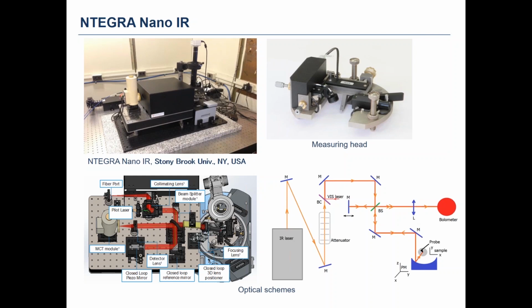And the second point is that if we would work in the scattering s-SNOM mode on the first harmonic of the cantilever oscillation, we actually could use this microscope interferometer as the optical beam detection setup. But the principal idea here is that we use the double frequency or triple frequency to get the nonlinear optical response of interaction between the sample and the probe.